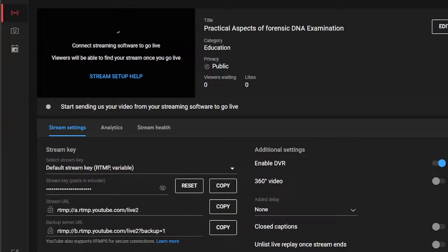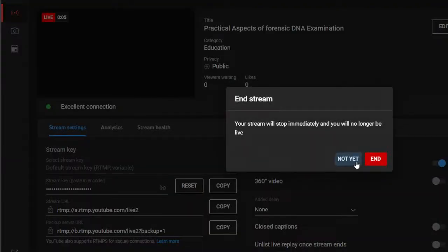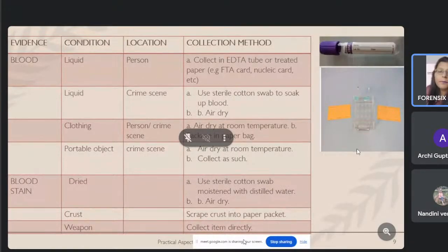A crust you can just chip off with a forceps or a tweezer, and you can directly add it to a paper packet and collect it directly, send it directly to the FSL. The weapon can be sent directly to the FSL, because if there is a weapon found at the crime scene, there has to be additional physical testing of that weapon also, right? So in addition to biological examination, it will be subjected to physical examination as well. So you just collect the weapon as it is and send it directly to the lab.